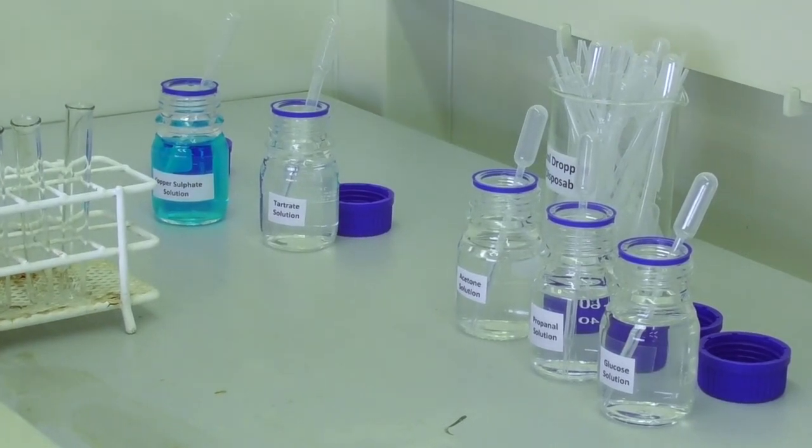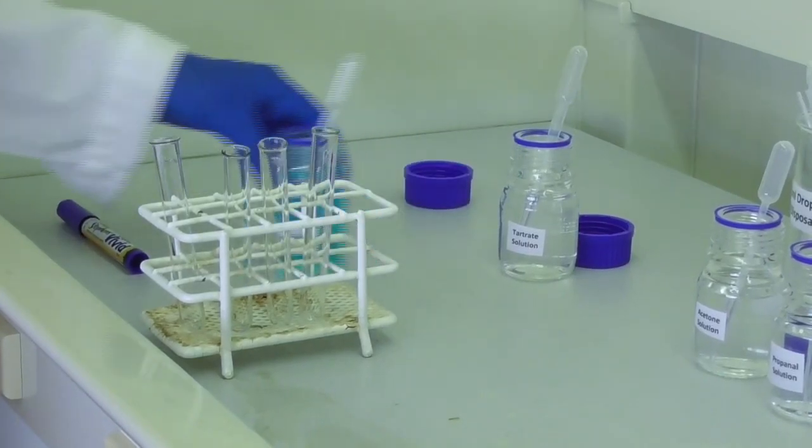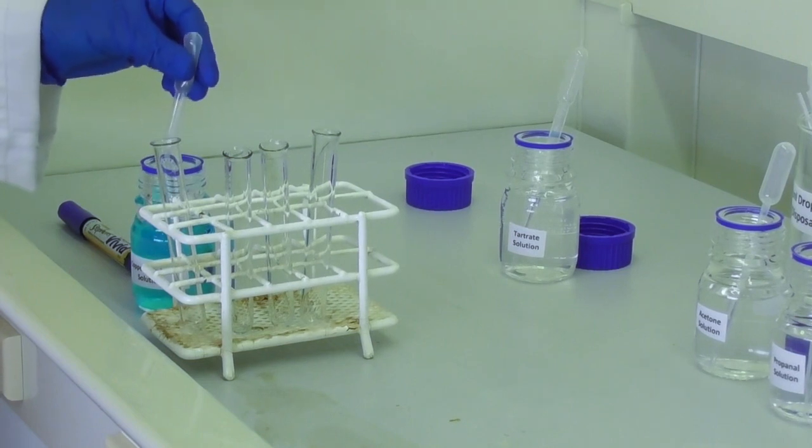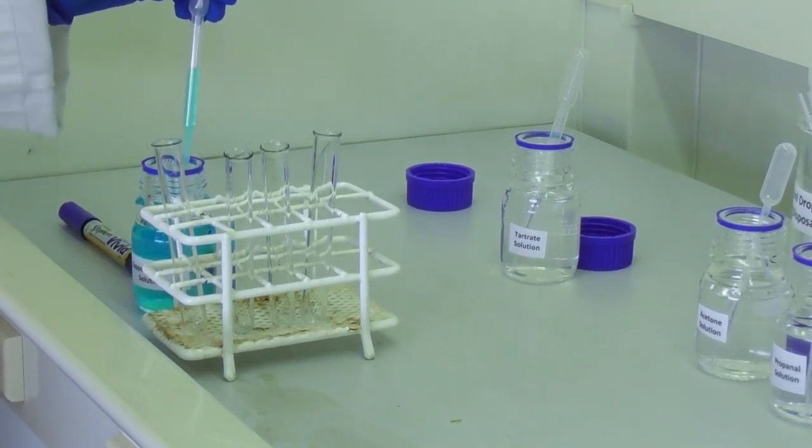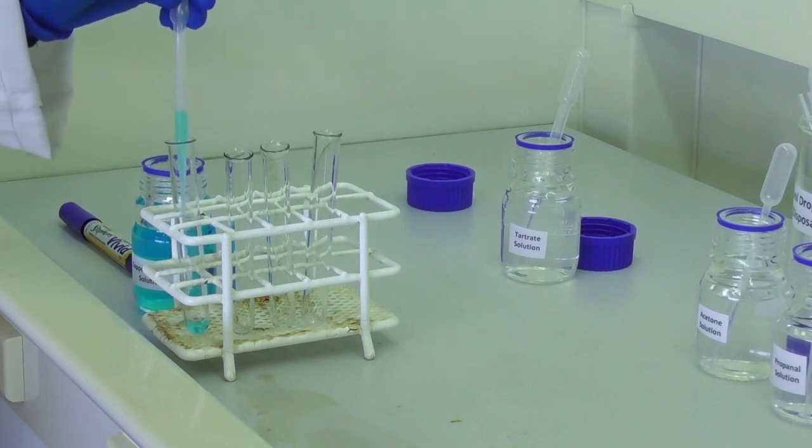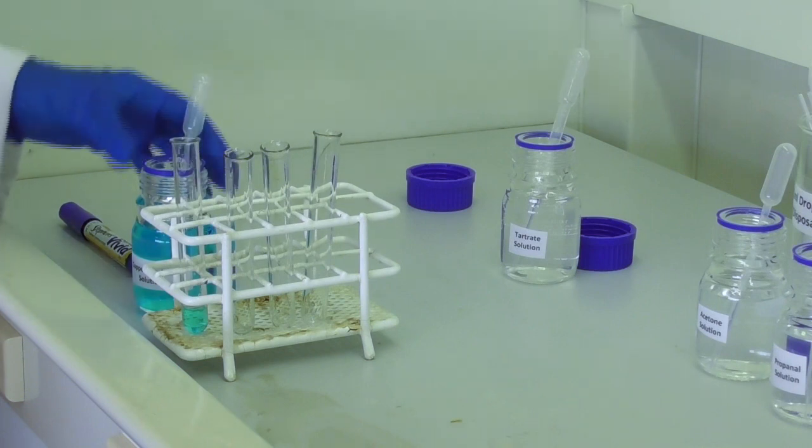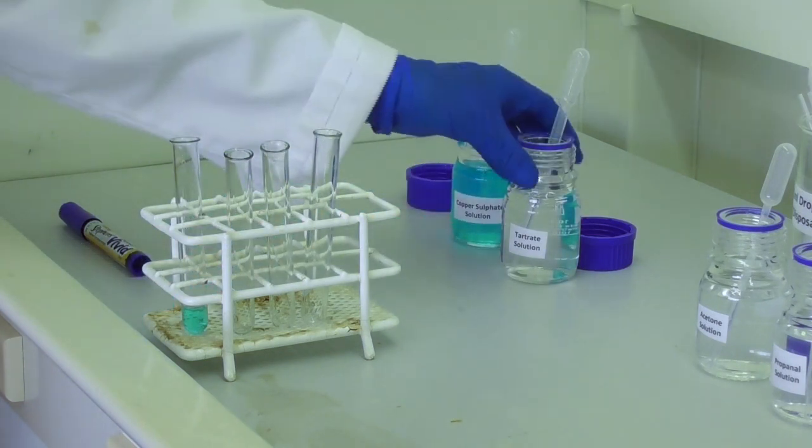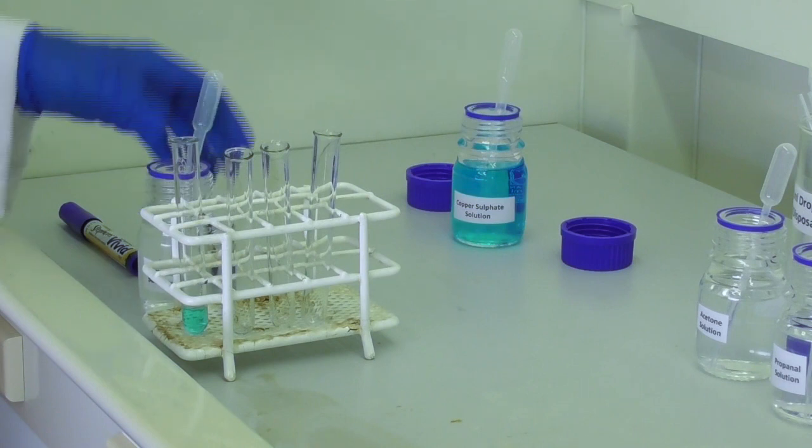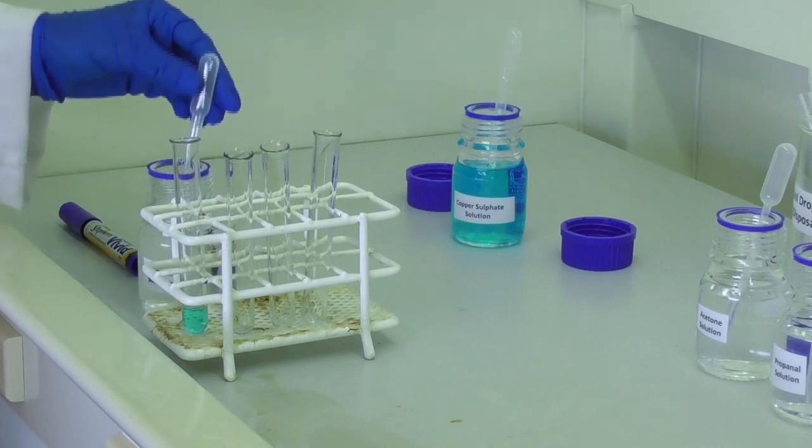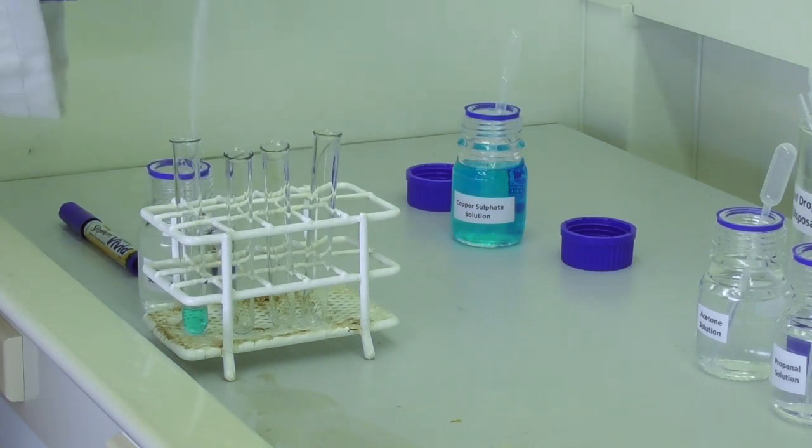To prepare Fehling solution, we add two milliliters of copper sulfate solution into a test tube. To this test tube, we also add two milliliters of tartrate solution.